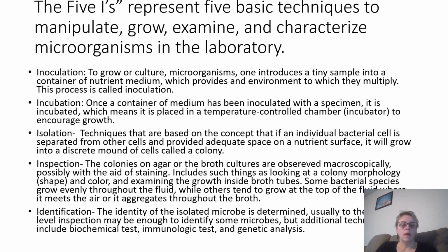Inspection. The colonies on the agar or broth cultures are observed macroscopically, possibly with the aid of staining. This includes such things as looking at colony morphology, that's the shape and color, and examining the growth inside broth tubes.